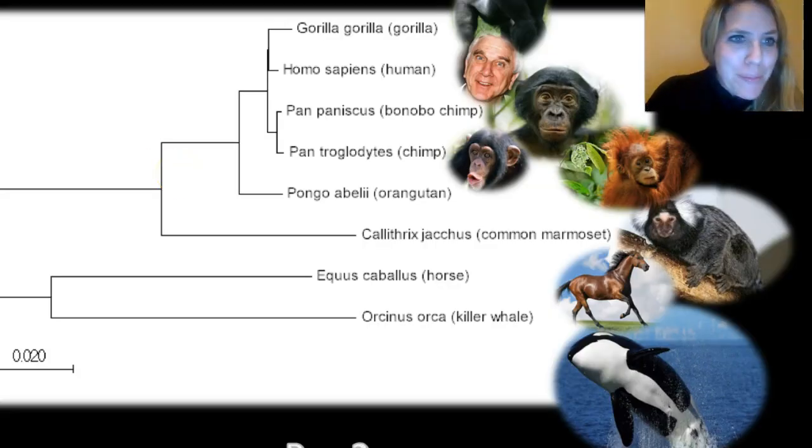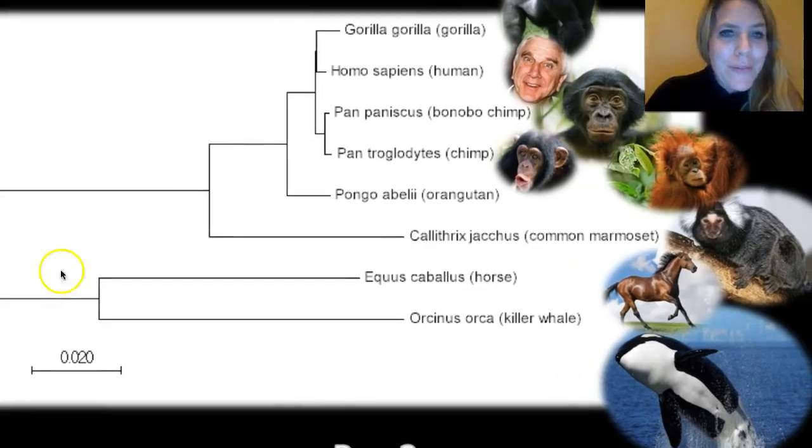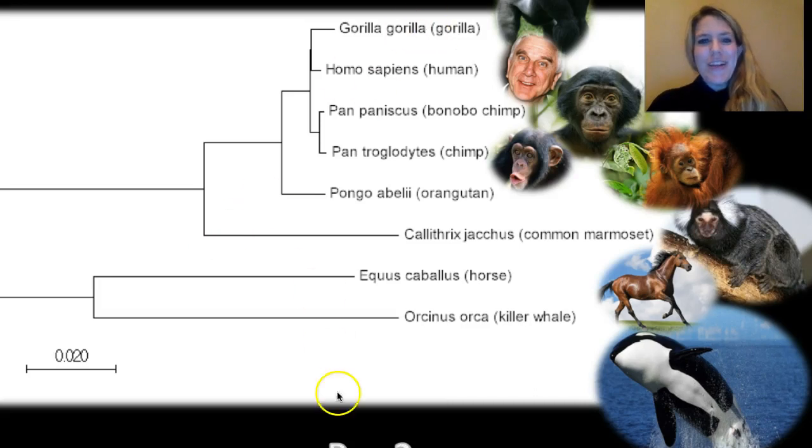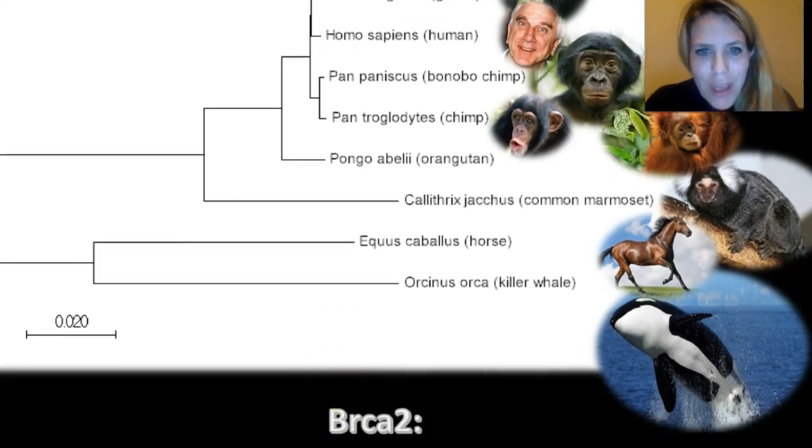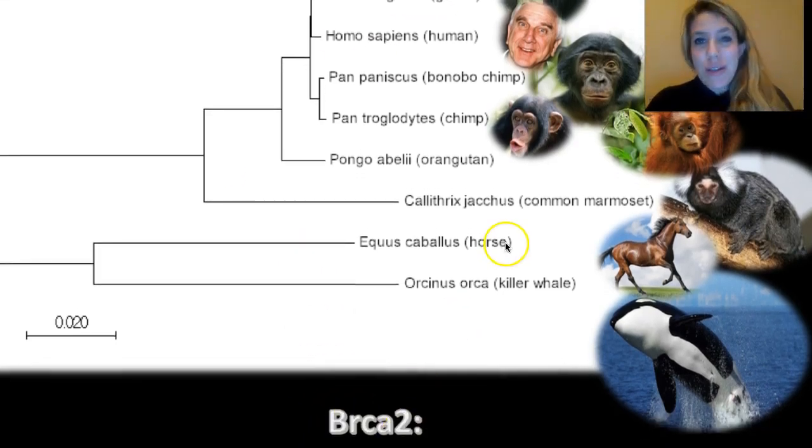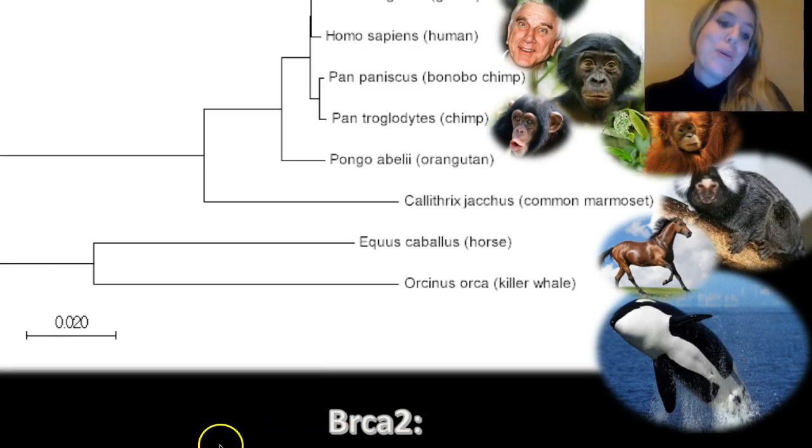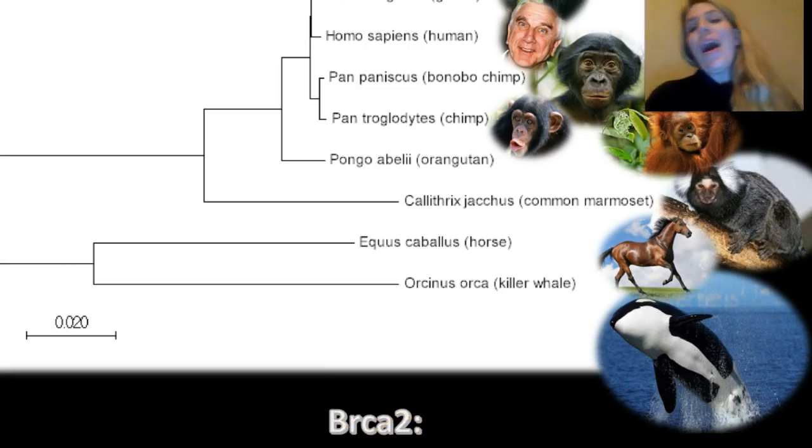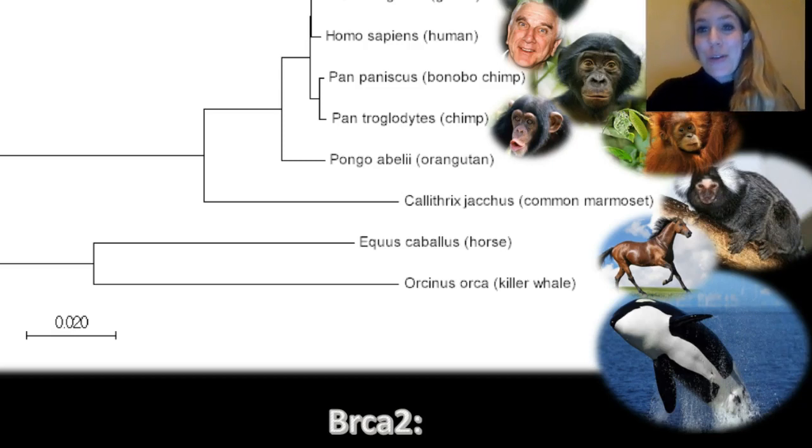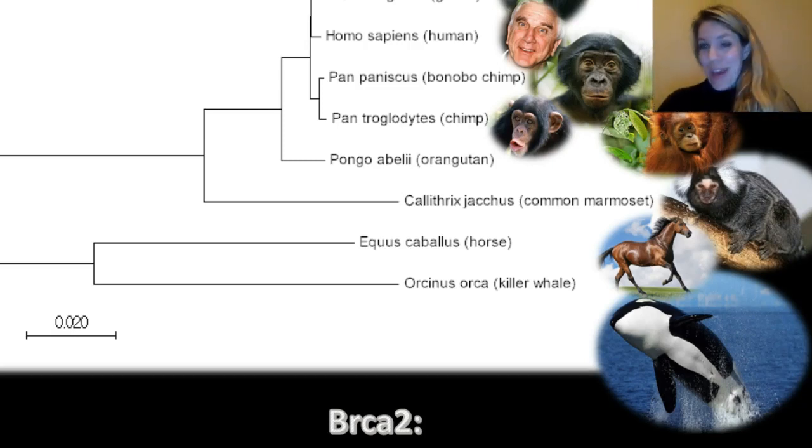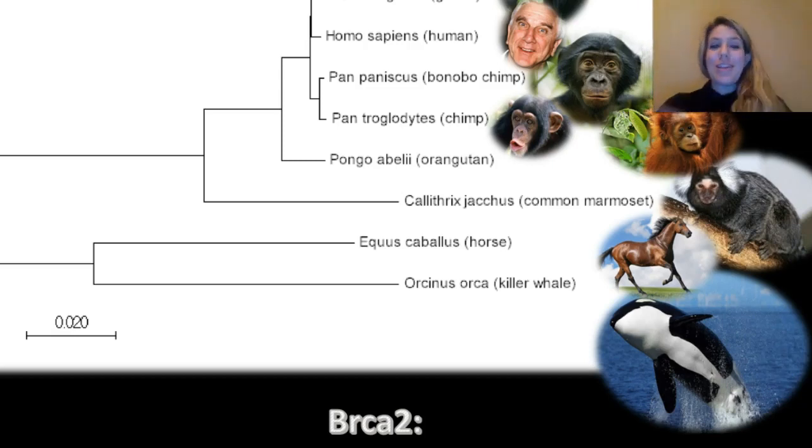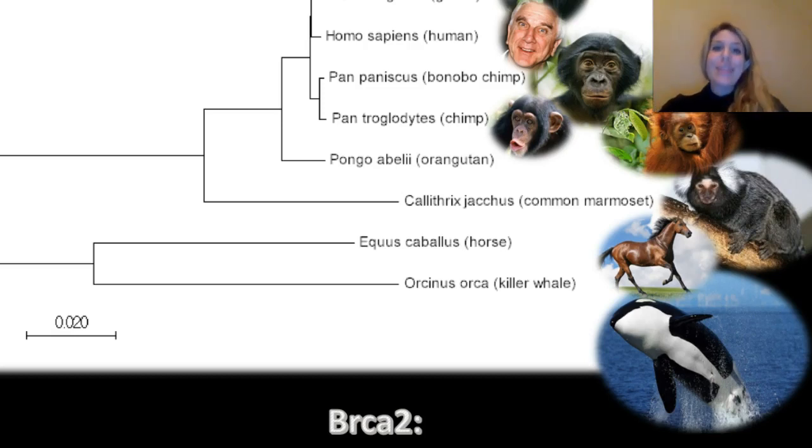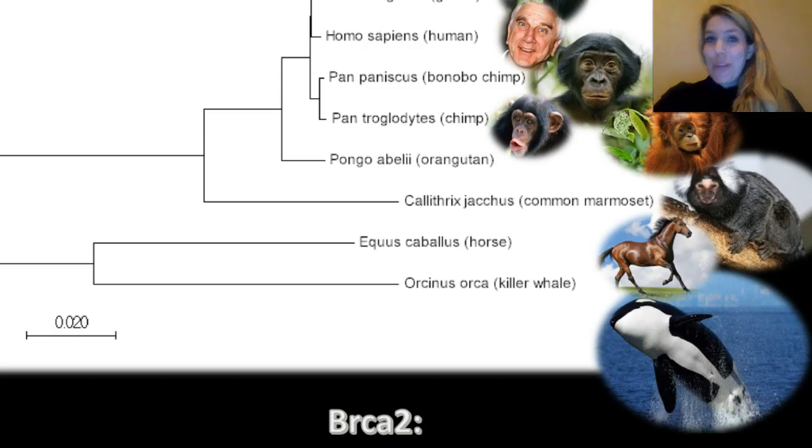So it's bigger. There you go. There's my whole thing. You can see on the bottom here labeled it with the breast cancer gene name. So anyway, that is how you do MEGA and that's how you create a phylogenetic tree of your particular gene so you can track the evolution of your gene.